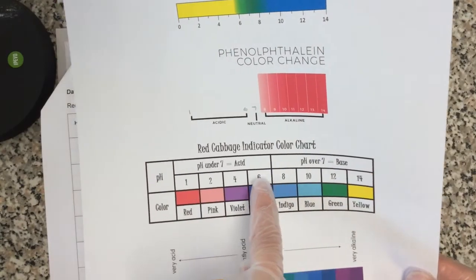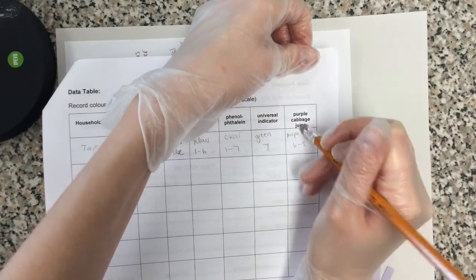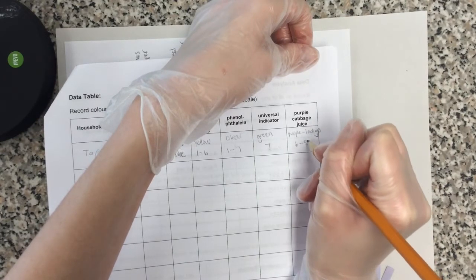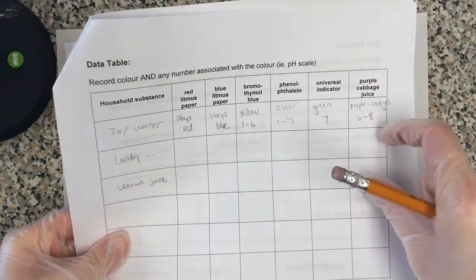And so it's somewhere between 8 and 6. Go ahead and add in your information for your other two samples. You should now have this entire portion filled in as well.